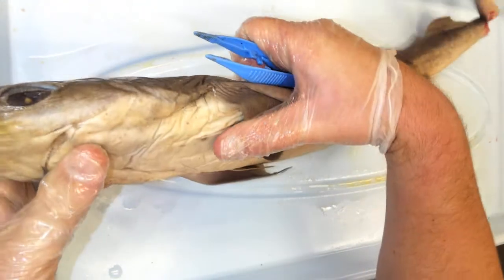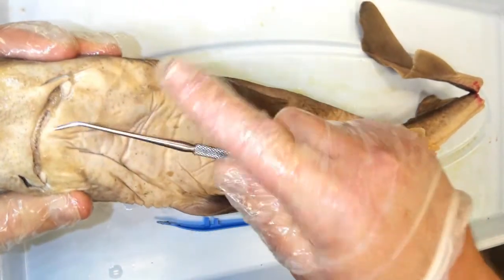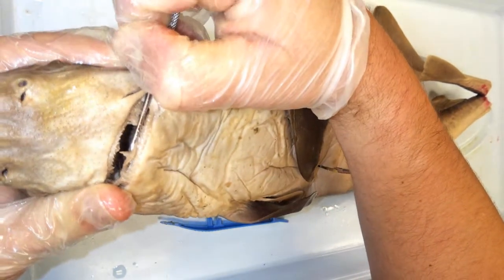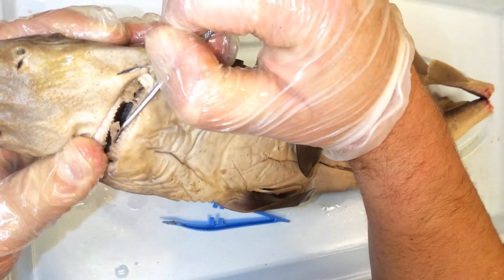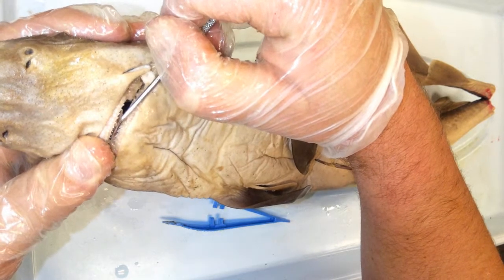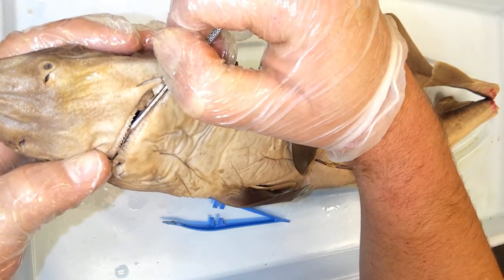Let's go ahead and take a look at those teeth. There are rows and rows of sharp, pointy teeth. Just like all sharks, these teeth are shed, but new ones are always growing back to replace them. They use these teeth to bite and rip their prey.